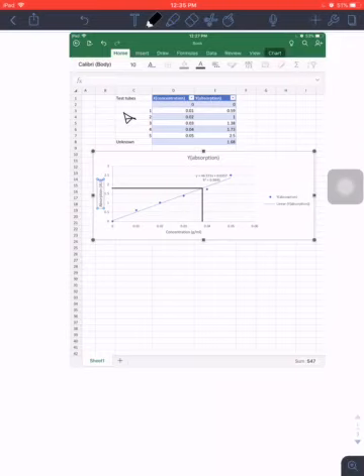We also had an unknown sample of Kool-Aid where we didn't know how much Kool-Aid mix was in the water. So we tested it for absorption, and we got a value of 1.68. The purpose of testing the previous samples was so that we can get an estimate of the concentration, or grams per milliliter of water, so we get a better understanding of where to place the unknown value of absorption.